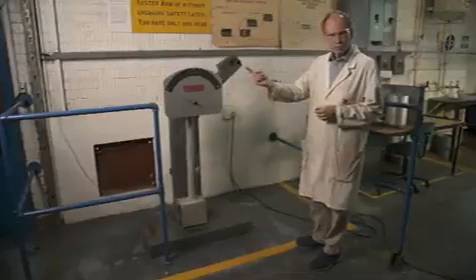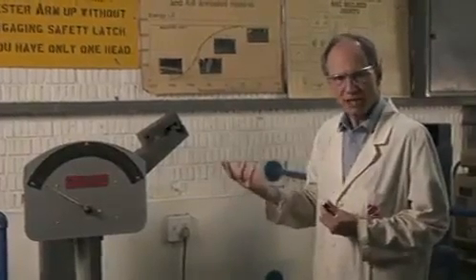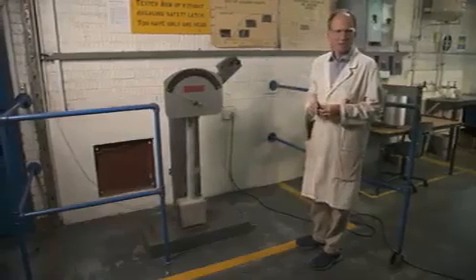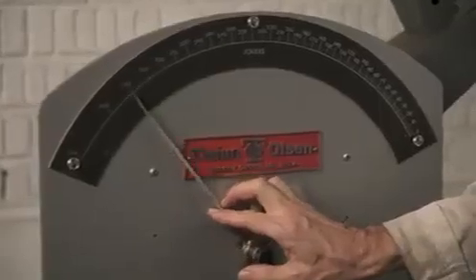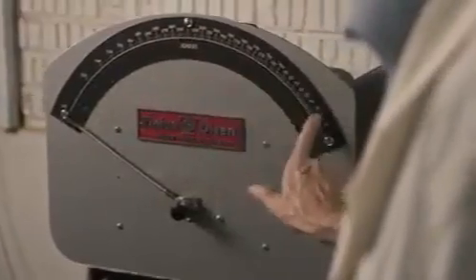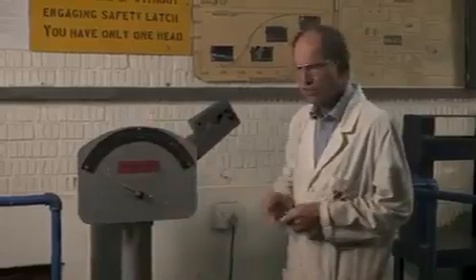It continues through to a certain height. And the difference in height, or the difference in potential energy, must then be the kinetic energy that was absorbed by the test piece. When it hits the test piece and swings to the top, the position that it swings to is indicated by this scale over here. And this has now been calibrated to give it in joules, in other words, the amount of energy that has actually been absorbed by the test piece. That scale gives it to you directly.